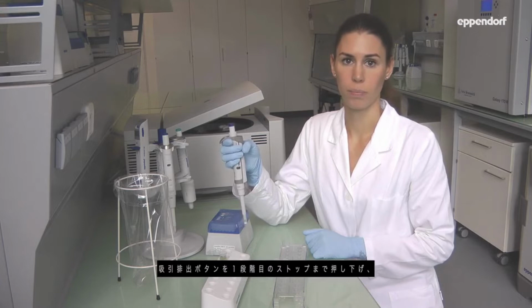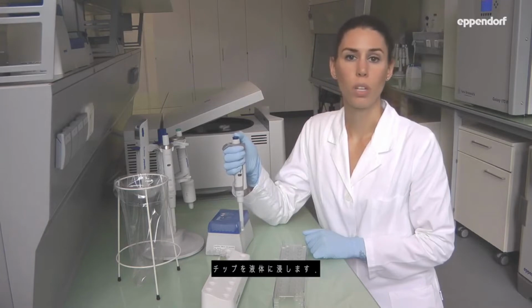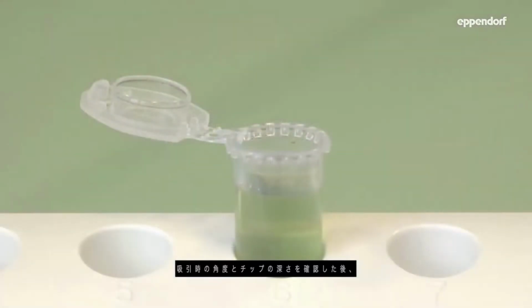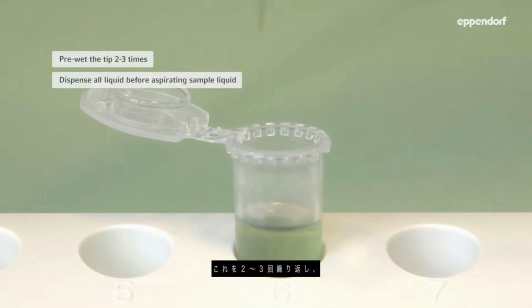Press the control button down to the first stop and immerse the tip into the liquid. Once the aspiration angle and immersion depth have been checked, slowly release the control button. Press the control button down to the first stop again and aspirate once more. Repeat this 2 to 3 times to saturate the air in the tip.